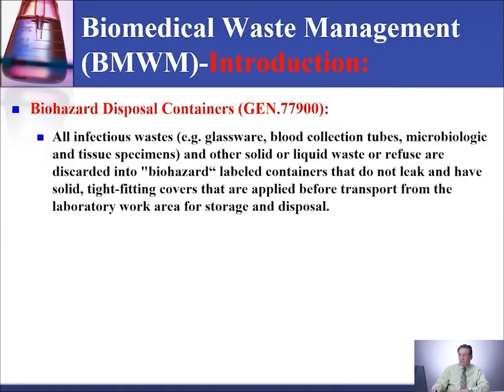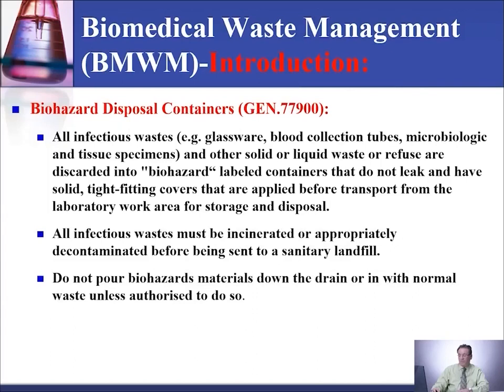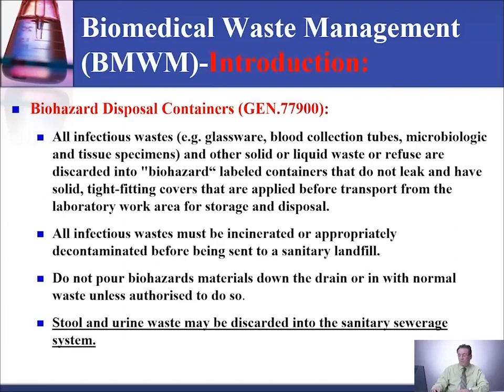The biohazard disposal containers, and you will find this in the LabGen 77900. All infectious waste and other solid or liquid waste or refuse are discarded into biohazard labeled containers that do not leak and have solid, tight-fitting covers that are applied before transport from the laboratory work area for storage and disposal. All infectious waste must be incinerated or appropriately decontaminated before being sent to a sanitary landfill. Do not pour biohazard material down the drain or in with normal waste unless authorized to do so. Stool and urine waste may be discarded into the sanitary sewage system.